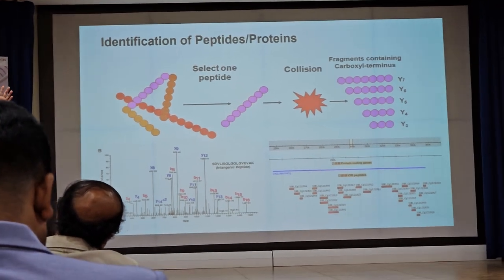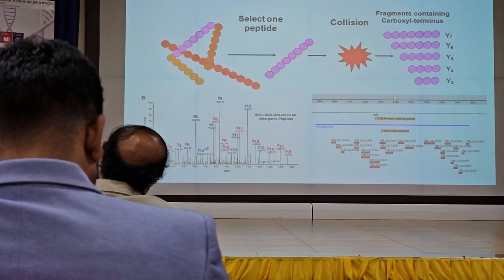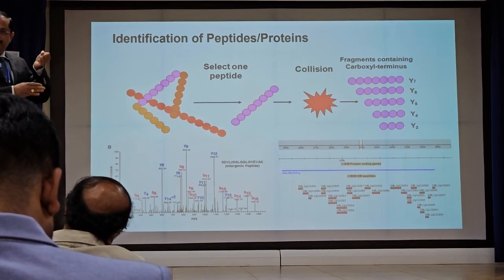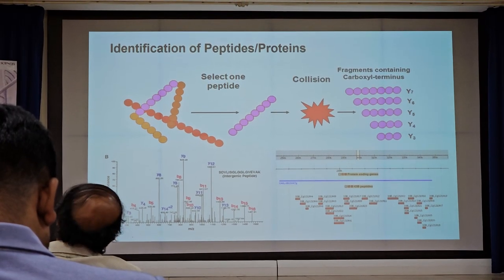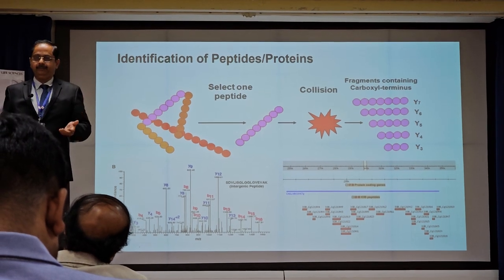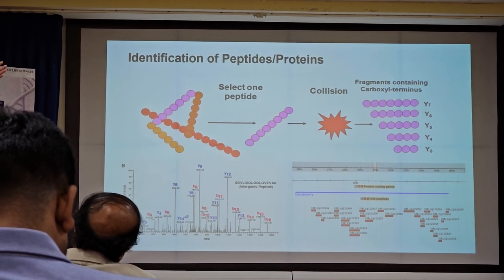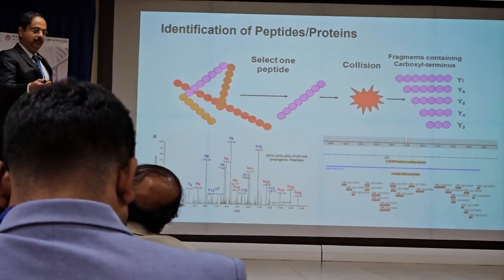So what you do is, whatever happens inside the mass spectrometer, that phenomenon you create in silico from a protein database. You take a mass protein extract from the sample, you take the protein database, and computationally you do whatever happens in the mass spec through computational algorithms. You create all possible theoretical mass spectra from a protein database, and then you compare experimentally derived mass spectra with theoretically derived mass spectra. You tell that this peptide is identified, giving statistical parameters, quality control, and many other things.